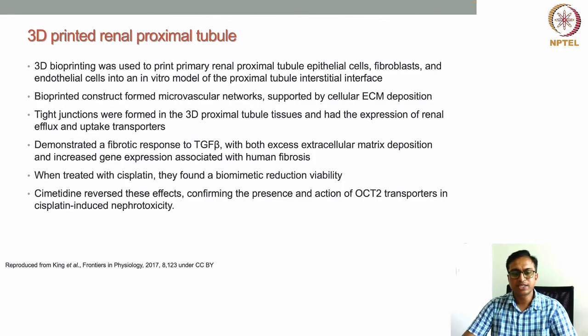The next study is also by King et al. They have produced a renal proximal tubule by bioprinting technique with endothelial cells, fibroblasts and epithelial cells, an in vitro proximal tubule interstitial interface. They bioprinted endothelial cells, printed epithelial cells, and fibroblasts and epithelial cells were used to develop this interstitial tissue.